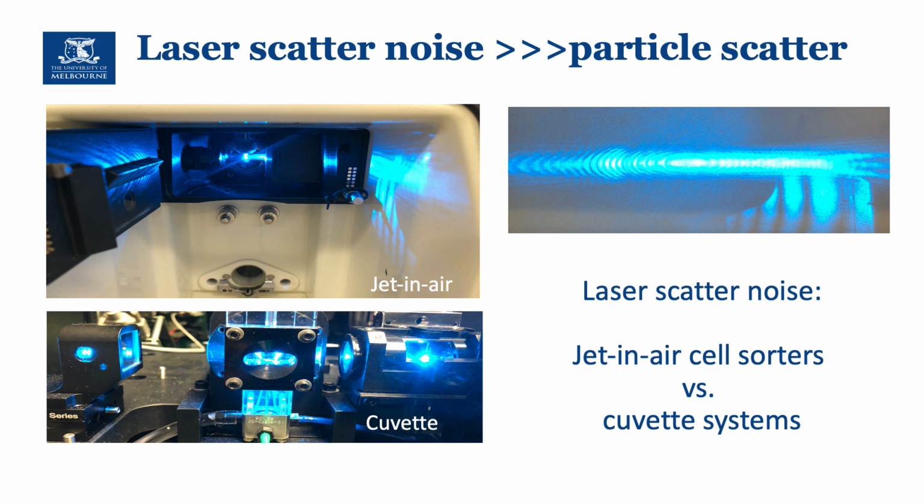So if you consider what scatter is measuring, it is light in the same wavelength of the laser. So these are the same kind of photons with the same kind of wavelength. The challenge in scatter measurement is how do you measure a particle from a surrounding overabundance of laser photons that are coming to hit the particle. So you need to have some special optics to differentiate nanoparticle signal from the noise that is coming from the laser. And these are two examples that I can show you here in the platforms.